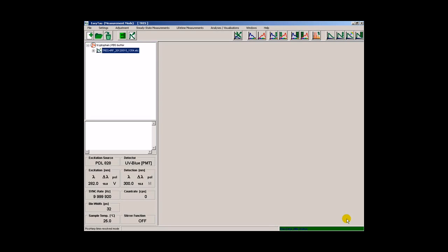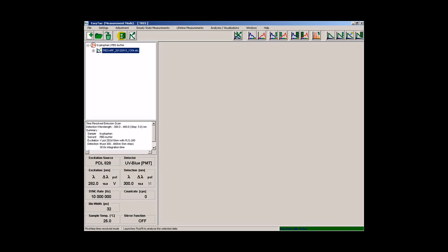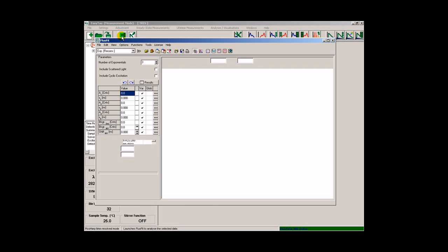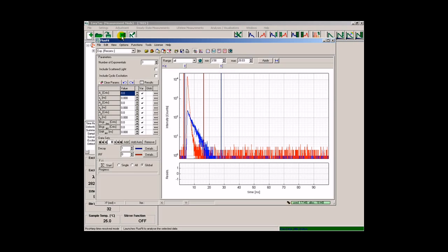To analyze the data, we simply select the container and launch Fluofit by pressing the Fluofit button. Fluofit loads with the selected dataset and also suggests an appropriate fitting model. In this case here, an exponential reconvolution fit with three exponentials.